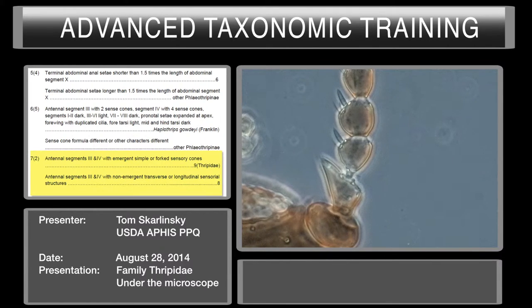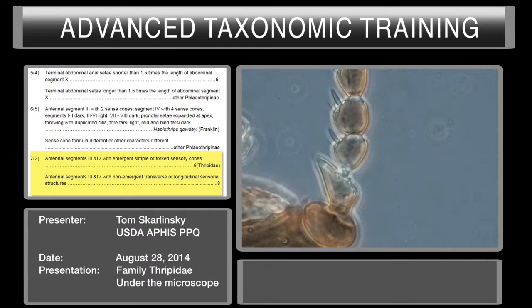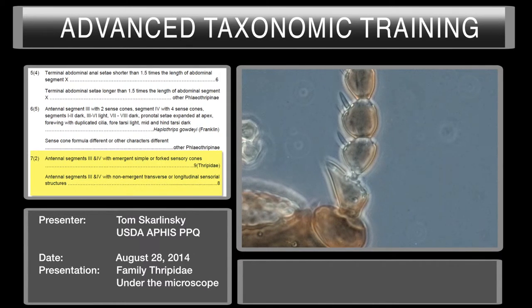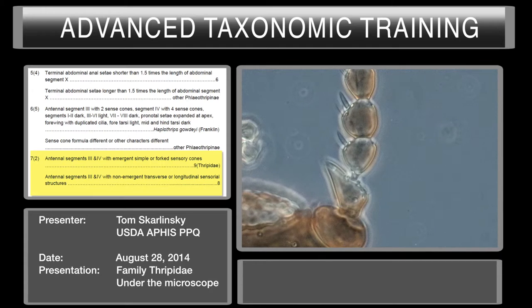Now occasionally you can get forked sense cones where the angle of those forked sense cones coincides with the angle of the antennal segment, and it'll appear that it's a simple sense cone. Because as you go into lower taxa, we're going to divide up groups that have simple sense cones from groups that have forked sense cones.